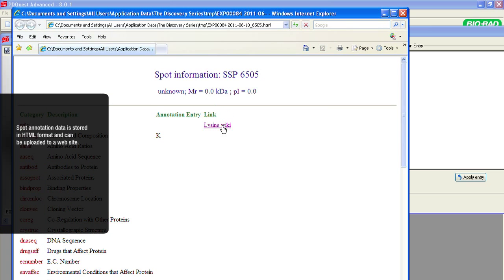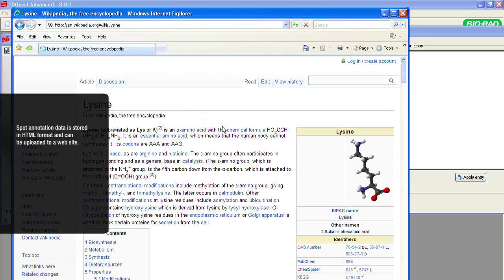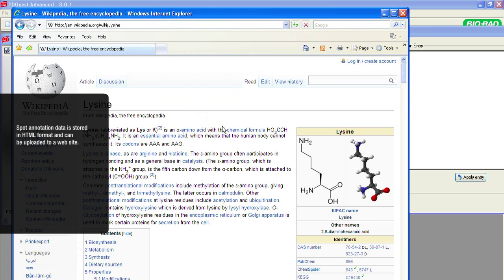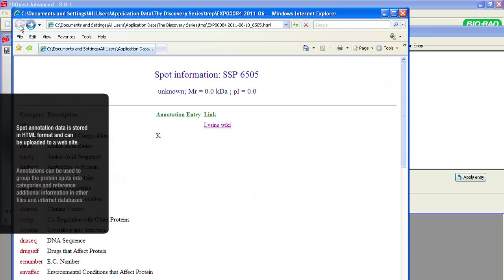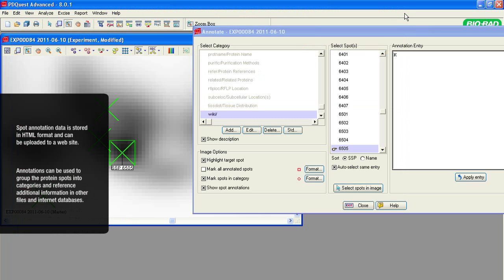Spot annotation data is automatically stored in HTML format and can be easily uploaded to a website. Annotations can be used to group the protein spots into categories and reference additional information in other files and internet databases.